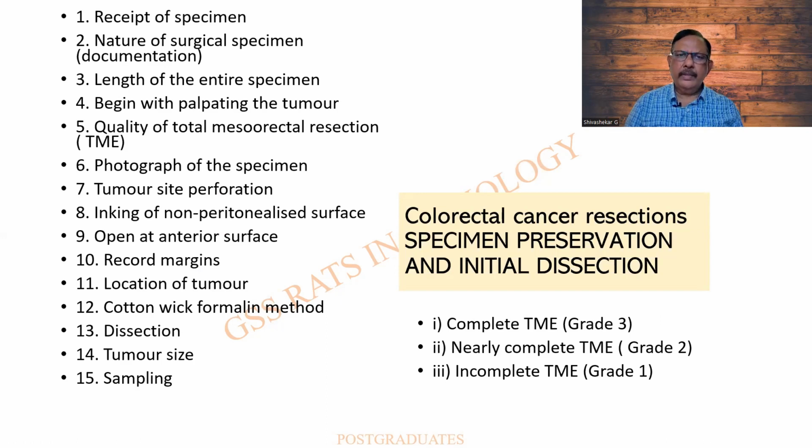Fundamentals are fundamentals. Always a request form with good detail is mandatory. Look at the panel of details that might be of great use to the pathologist and to the forthcoming diagnosis. These are all things which are essential, so much so that even a photograph of a specimen is being mentioned. Otherwise, a line diagram would at least suffice.